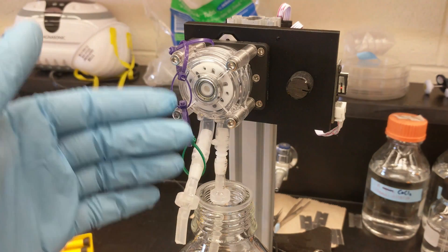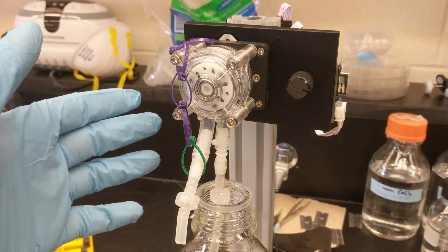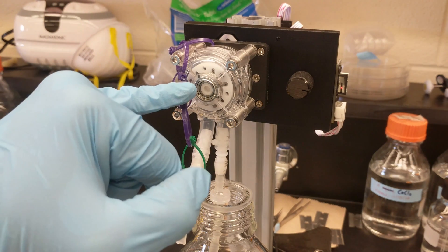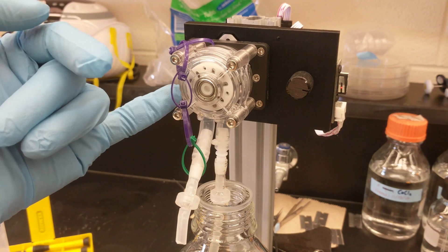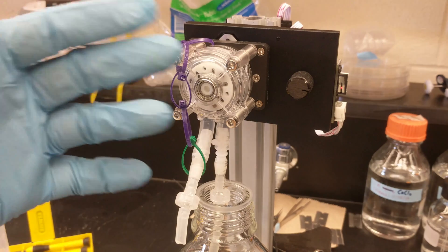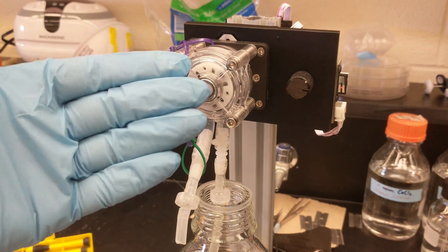But this machine is actually incredibly accurate at dispensing with only one caveat. So as long as you're dispensing more than let's say 5 or 10 ml at a time, you can get I would say within half a percent accuracy.